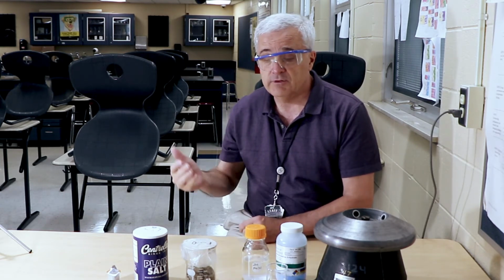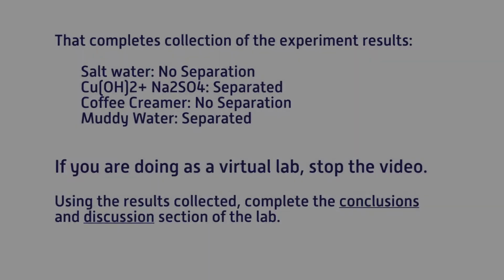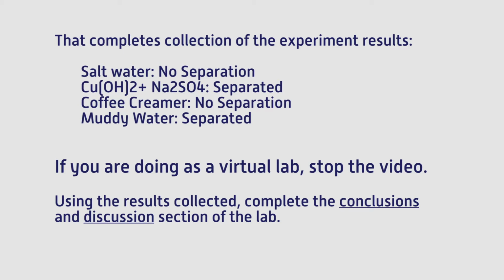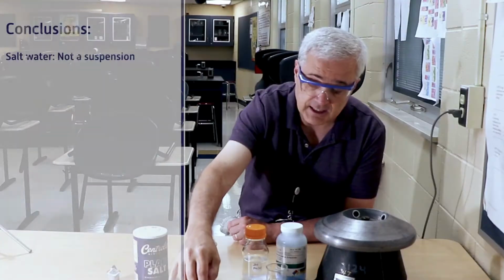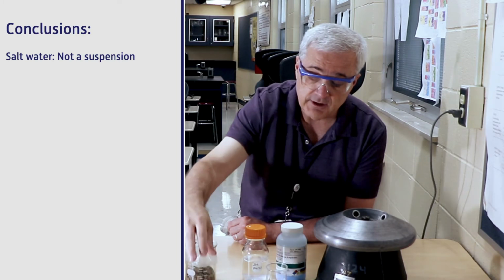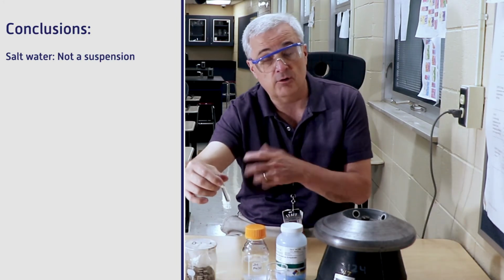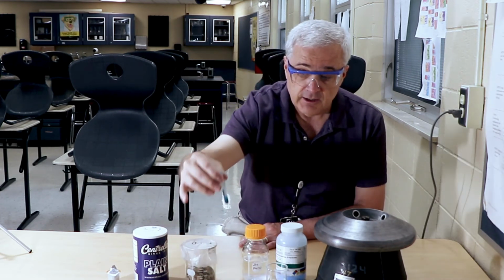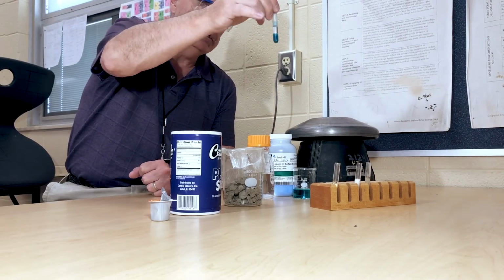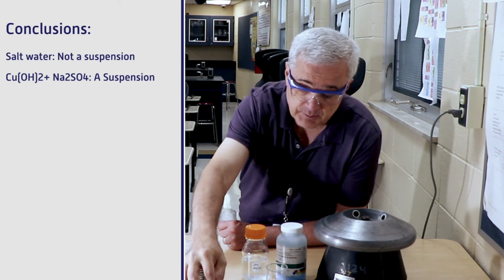Now, if you are doing this as a virtual lab, you need to write your own conclusions and discussion, and that part, if you're just watching the video, we'll talk about the results. All right, so because there is no separation, sodium chloride is not a suspension. Now, it could be a solution or it could be a pure substance. We don't know. This test does not tell us what it is. It tells us that it is not a suspension. So the copper hydroxide sodium sulfate mixture did separate. So we know that that was a suspension.